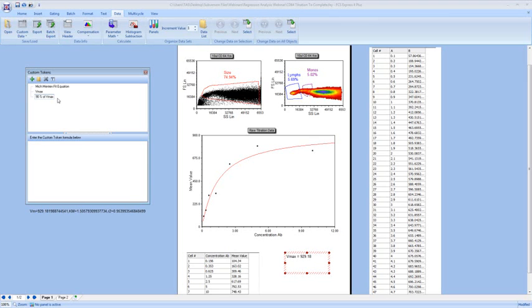And this formula is actually just going to equal this token, so I'm going to highlight it and drag it into my custom tokens here and say times 0.9, and when I do that I should be able to drag this out into my box here, and let's make sure that this value is correct.